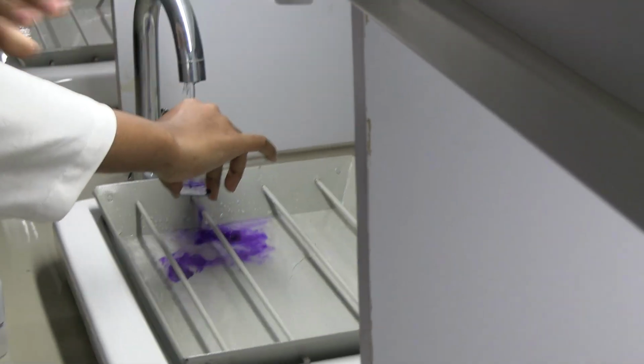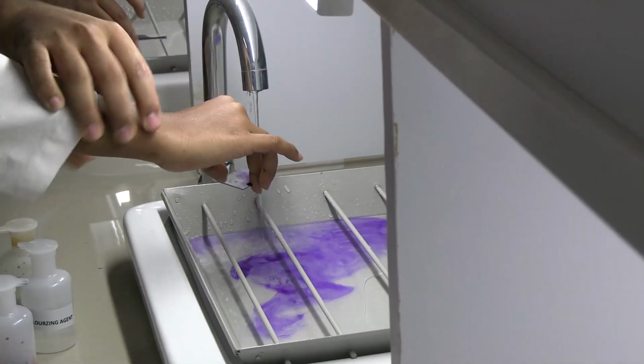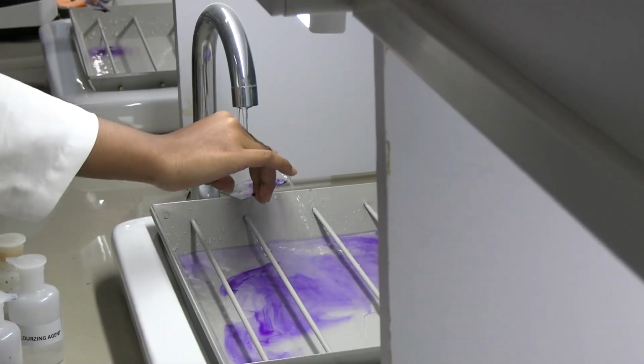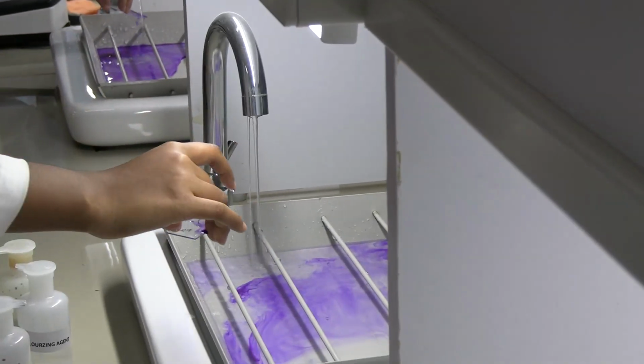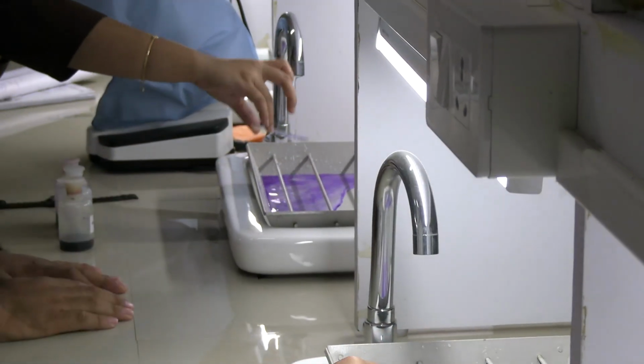Come from here. Okay. I think that's enough. Don't do it too much. I'll put it on the staining area. She's doing it perfectly, but stop it. Otherwise, you're gonna wash away the whole smear. Okay, now put it here.